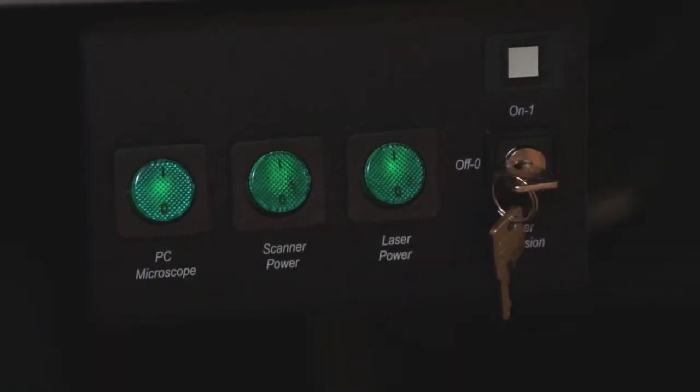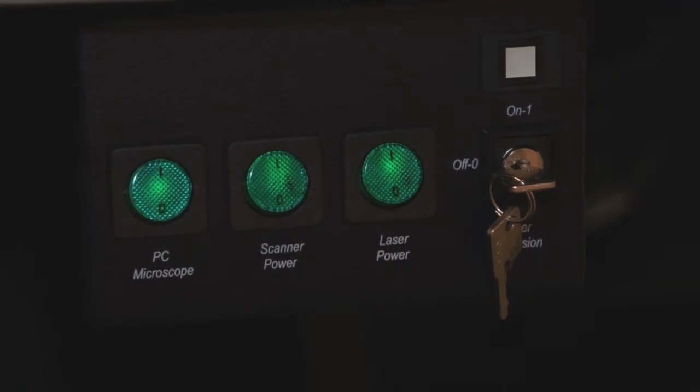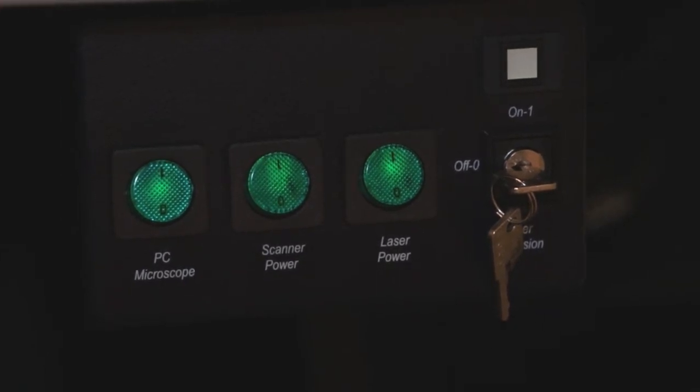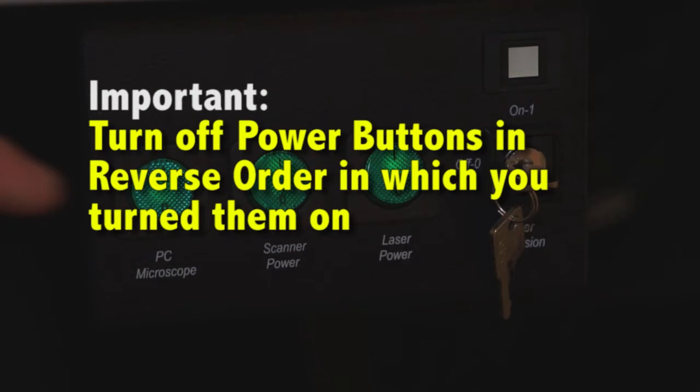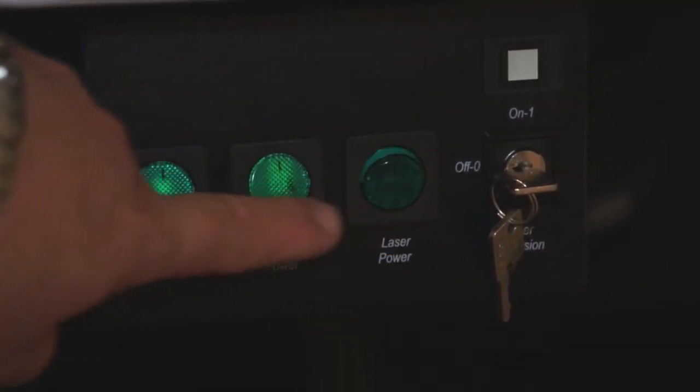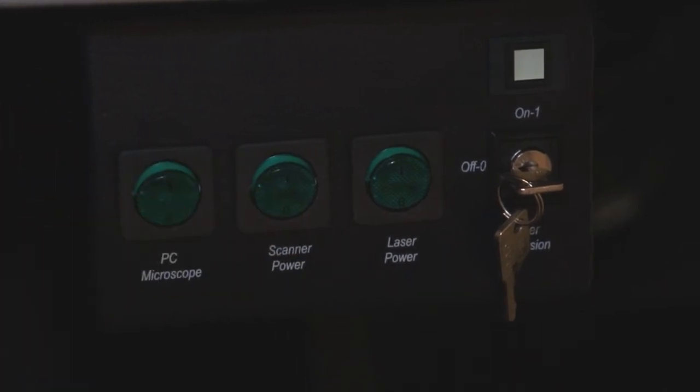To turn off power to the system, you now depress each button in the reverse order to which you turned them on. So from right to left until all the power is off.